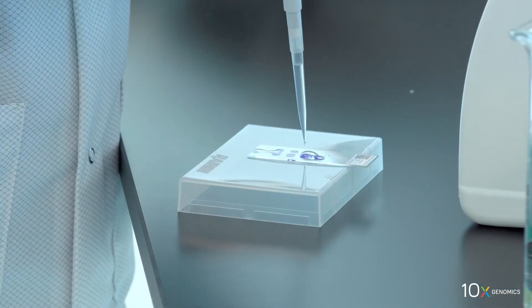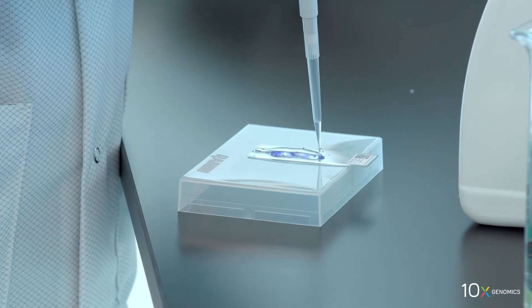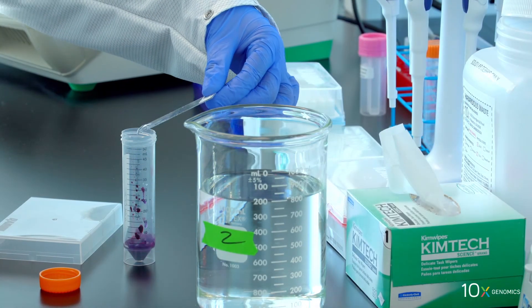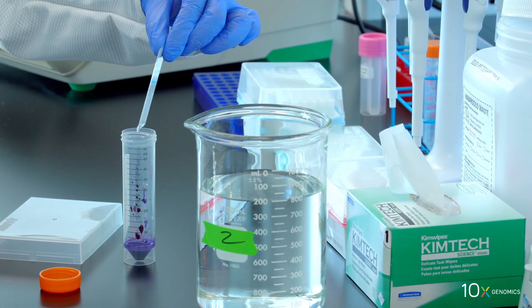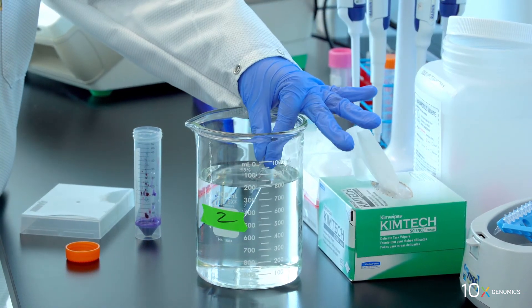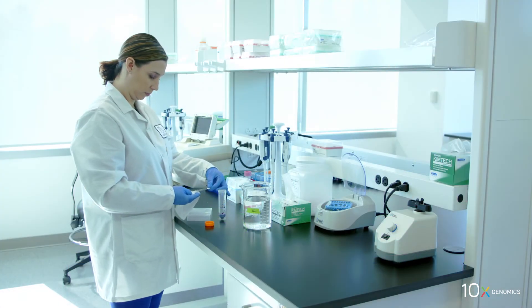Next, we will add bluing buffer to the slide. Add one mil of bluing buffer to uniformly cover all tissue sections. Incubate for two minutes at room temperature. Discard the reagent by draining and/or holding the slide at an angle with the bottom edge in contact with a laboratory wipe. Immerse the slide five times in the water in beaker two. Wipe excess liquid from the back of the slide without touching the tissue sections.